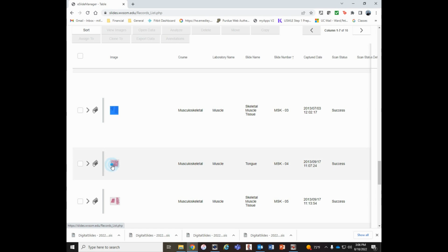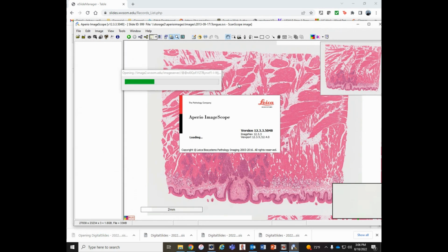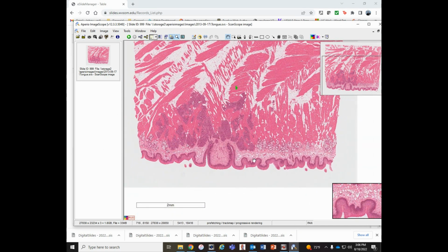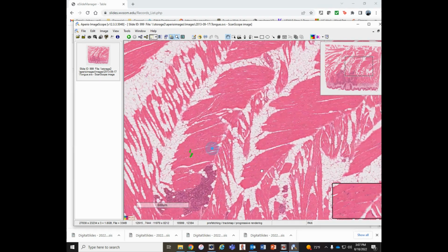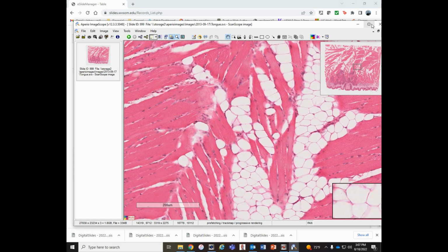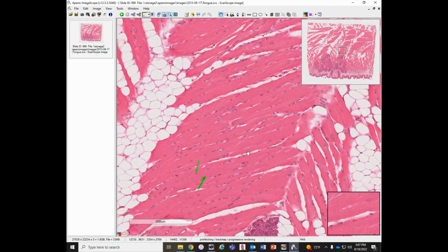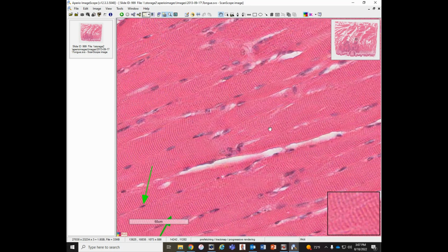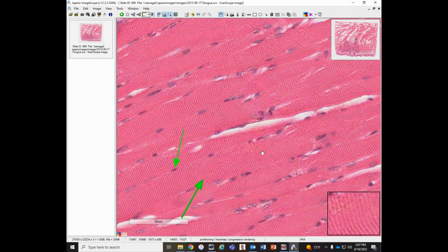Now here we have one last section of skeletal muscle, and we are beating this rather to death. However, this particular specimen, it's the tongue. We got the taste buds out here and papillae, but this one has the nicest striations of any that we've seen. Let me zoom in accordingly, make a little room here. So here we can just see the striated nature of the skeletal muscle cells so clearly. So right here, peripheral nuclei, A bands and I bands, super clear.